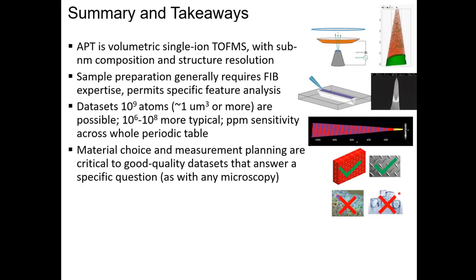Making a good choice for your material and your planned measurement is going to be critical to getting a good quality data set and answering a specific limited scientific question. And this is, of course, true with any of the techniques that have been discussed or will be discussed in this Masterclass series. In the case of atom probe, the restrictions we've already gone over are quite important. Unlike other techniques, because of the issue of fracture in atom probe, if your material choice or specimen preparation are not very good, you will not get bad data, you will get no data, you will get a fracture event and a mess on the electrode.